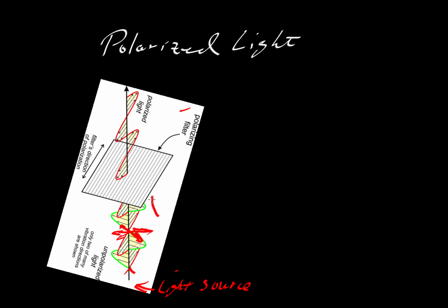Then we have this bit of polarizing film. This is what we call the lower polarizer, or sometimes the lower Nicol, and that's in honor of a French fellow, Nicol, who developed this method of microscopy. So notice that the way that the Nicol is illustrated here, it only passes light, relative to our view here, that vibrates in a north-south direction.